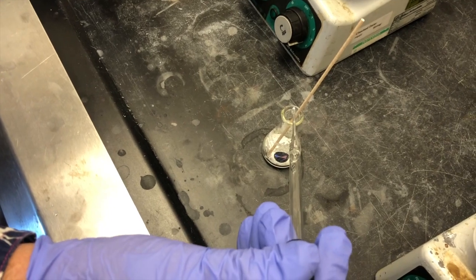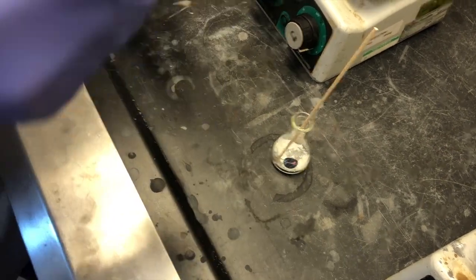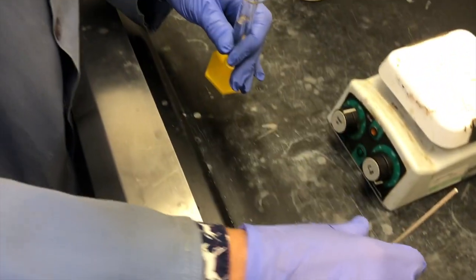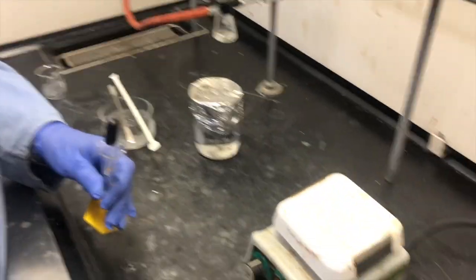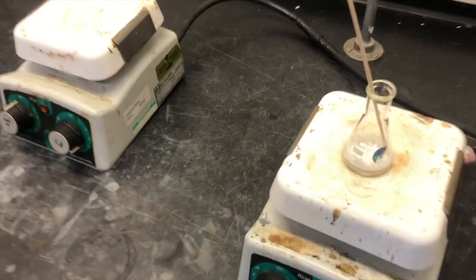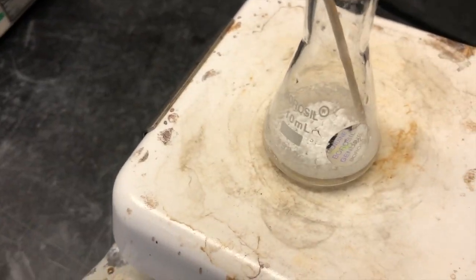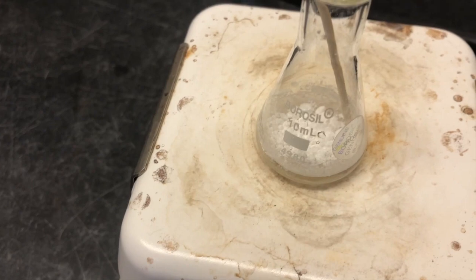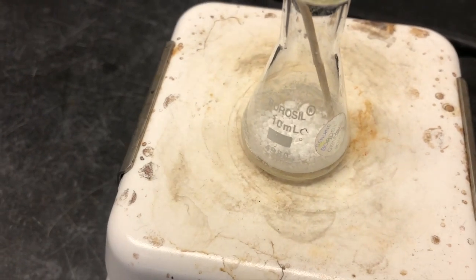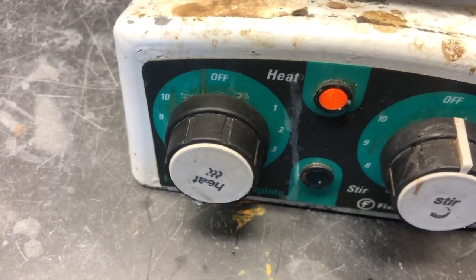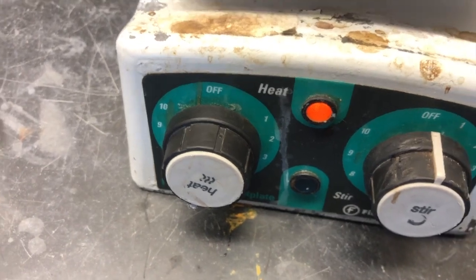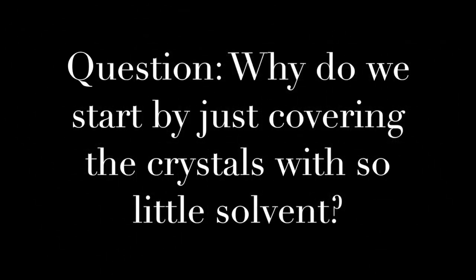We begin by adding a small amount of water from a graduated cylinder that originally had 10 milliliters of water exactly in it. We add just enough water to cover the crystals and then place it immediately on the hot plate. When recrystallizing from water it's okay to put your recrystallizing mixture directly onto the hot plate and set it at a temperature that would boil the water.